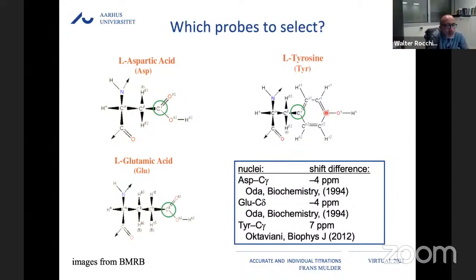I have a question. Let's say you have a protein that in its binding site has two titratable residues, like two aspartates or glutamates. I have in mind beta secretase, for example. What can the state-of-the-art NMR experiments say about their protonation?